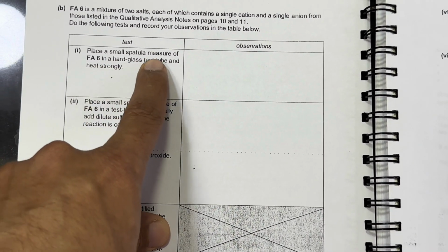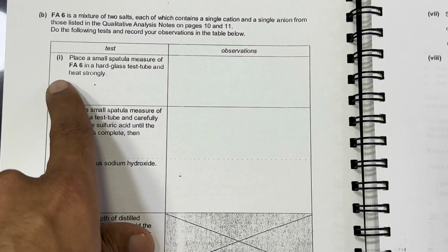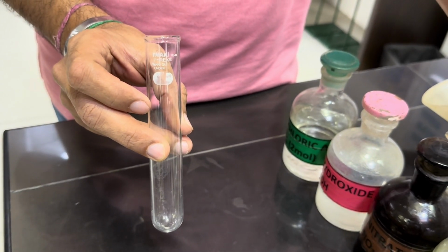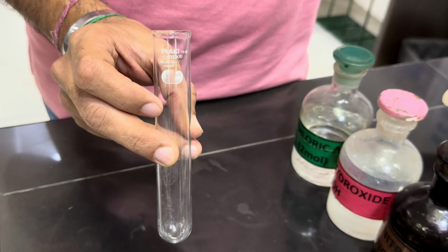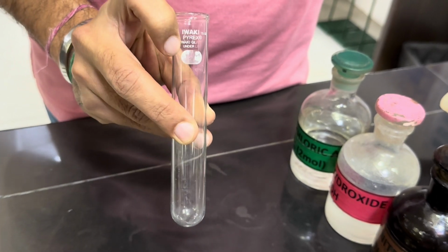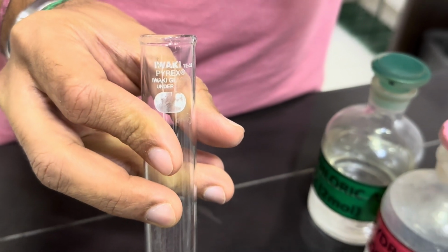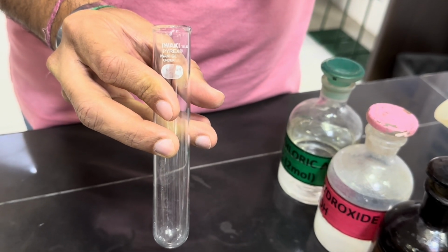Place a small spatula measure of Fa6 in a hard glass test tube and heat strongly. Now, this is what we call a boiling tube. It's actually made up of a hard glass and it's basically a bit thicker than the rest of the normal tubes. This is made up of Pyrex. We can see it's here, Pyrex written. So this Pyrex means it's made up of a hard glass which can bear higher degrees of temperature.